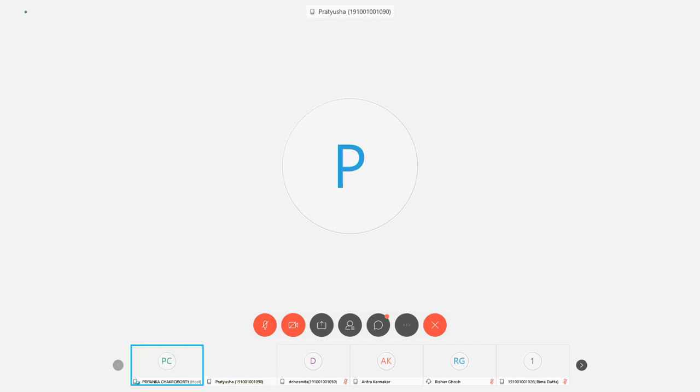So now we will start some kind of discussions. The video is actually the general overview of how we detect, how we can identify. But here are some questions that can be asked in Viva or that can be given in your Google Classroom assignment. That phenol is phenol. All of you know phenol, the structure of phenol.